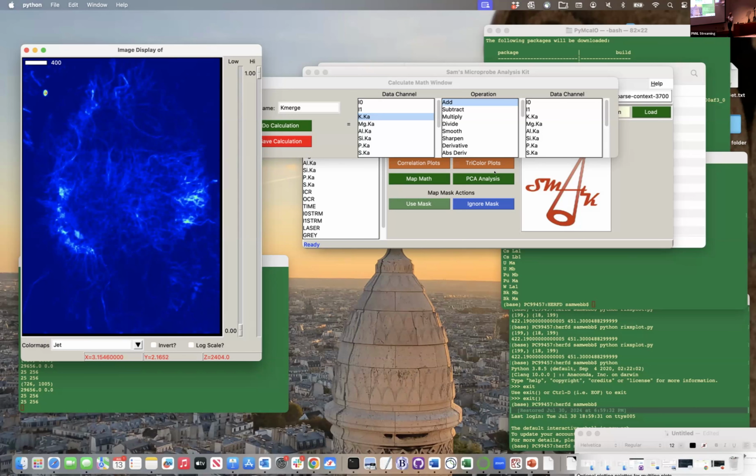So we have one case where we have our small, like 1 centimeter stage, and then a case where we have the meter long stage. So they're not going to match coordinates. So this is where we treat it like a separate mode of data, and we treat it like MALDI data or IR data, and we use those visible images to tie those together. I think I'll actually go and do that in a second here too.